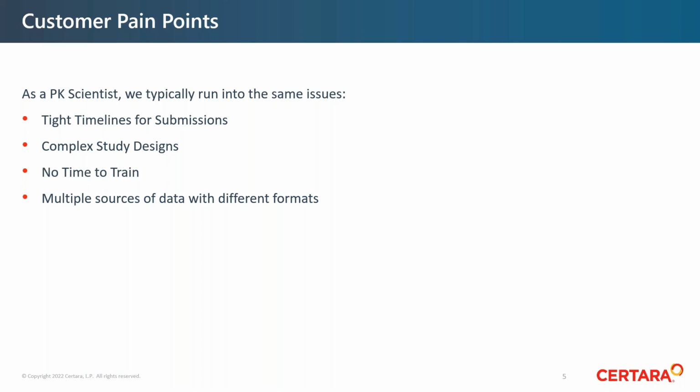And then, when it comes to utilizing Phoenix, Phoenix is a very powerful tool, but it takes time to train on it and figure out how to use the objects within Phoenix to modify the data in the ways we need for our analysis. You would end up having to create extremely complex workflows. Once you got the training down, that was very beneficial, but if you don't have that initial training or experience, it can be kind of difficult to get that down.